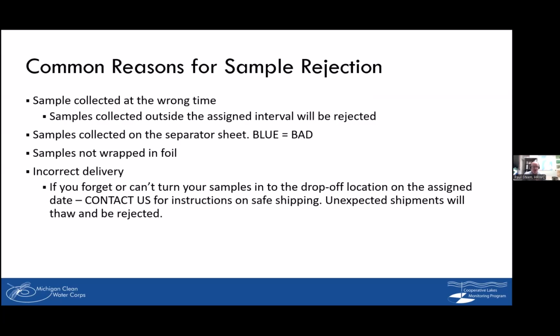Remember to refer to your sampling schedule to remember the dates you should be sampling. So if samples are collected outside of the proper interval, then we can't trust that data going forward in a long-term data set. We always have to follow the procedures for data quality purposes.